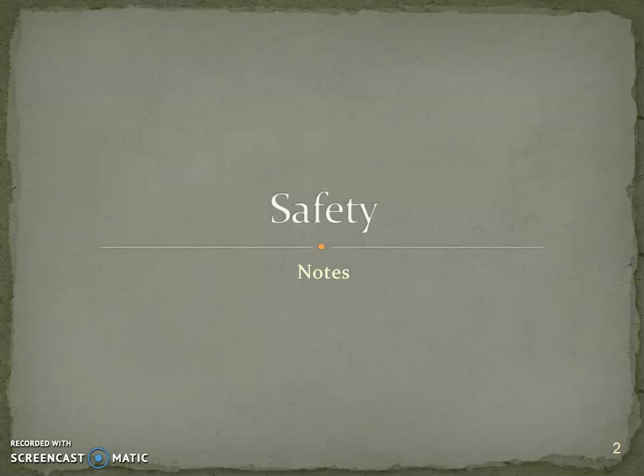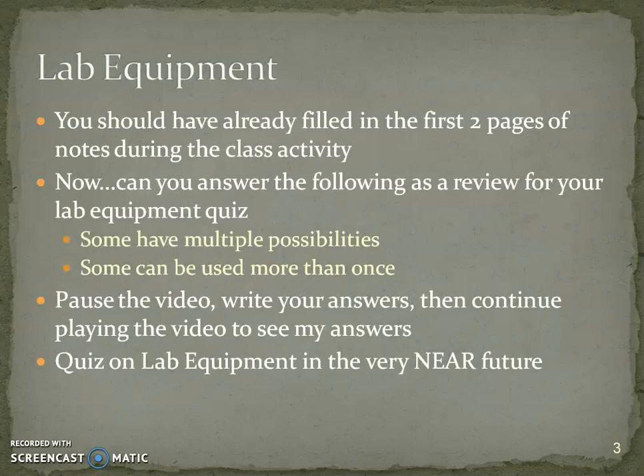This is Mrs. O'Neill for your safety notes. You should have already filled in the first two pages of your packet. Now you can answer the following questions as a review on which lab equipment to use.